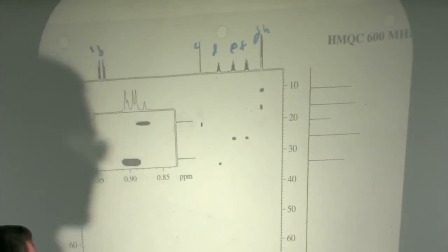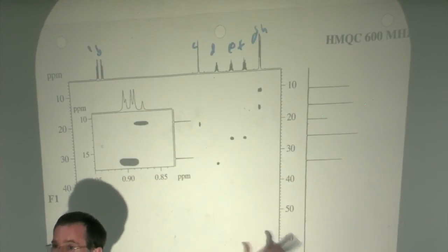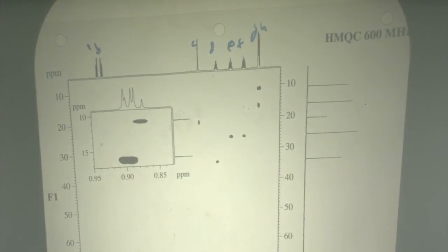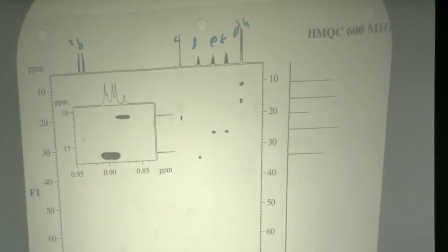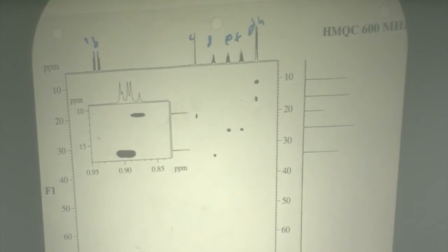You notice we've left out the carbonyl at about 170. That was another thing that clued me into an ester. The carbonyl was at 170-something ppm, a typical ester, so it's not a methyl ketone or an aldehyde. A methyl ketone I'd expect at like 205 to 220. An aldehyde I'd expect at like 190 or 200. So I am pretty darn sure this is an ester.